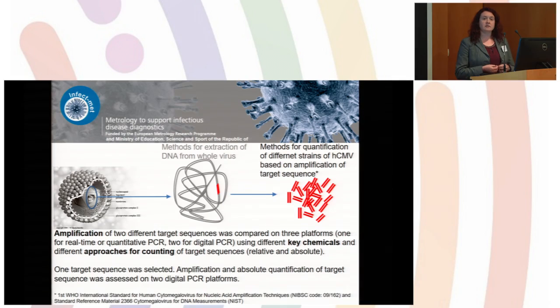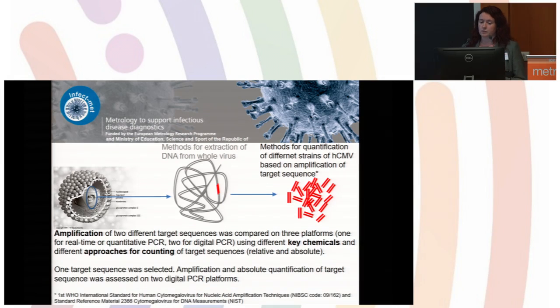We have done this on 3 different platforms. One is real-time or quantitative PCR. This is the approach that is also widely used in clinical laboratories. And the other approach is digital PCR, and we have used 2 different platforms. With these platforms, we were also using different key chemicals for amplification and different approaches for counting. One approach is relative, connected with quantitative PCR. The other is absolute, with digital PCR.